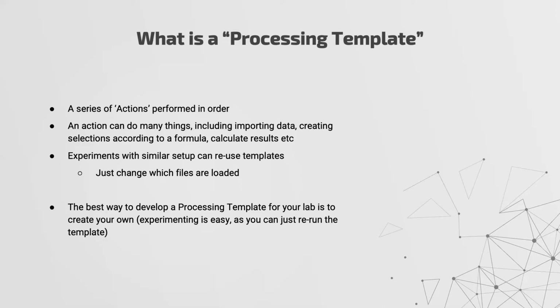And as we'll see today, there'll probably be a bunch of times when you're experimenting with the processing template, where the best way to do it is to just get in there and start putting in actions. The worst thing that it can do is that it'll create a session file that's rubbish. You just close it and start a new session. So don't be afraid to experiment. iolite never changes your input data, so it'll never change the data you got from your mass spec. So you can just keep rerunning processing templates on it.